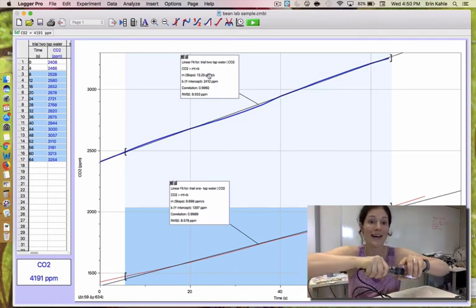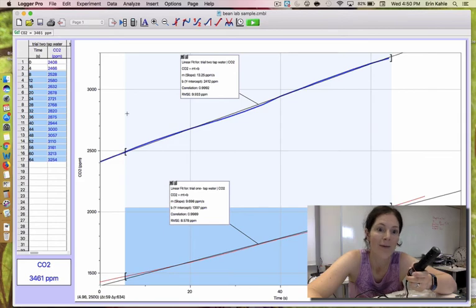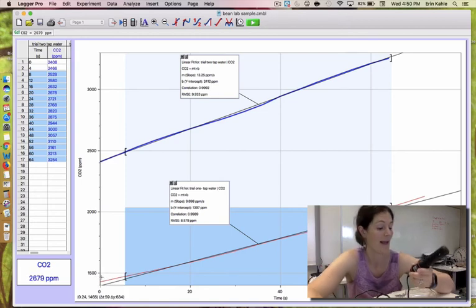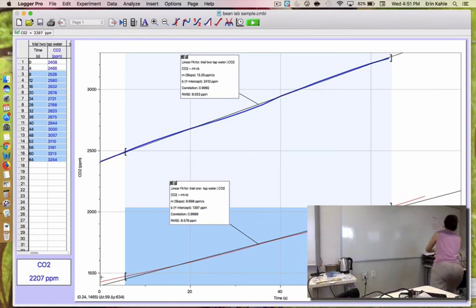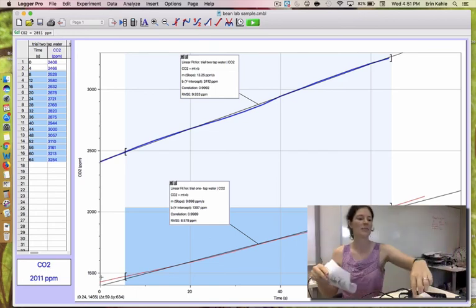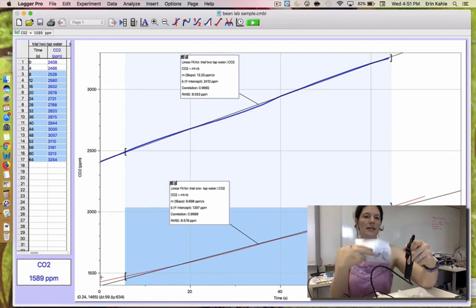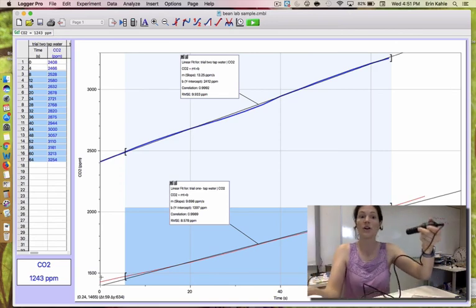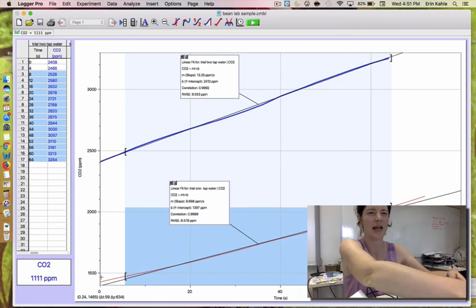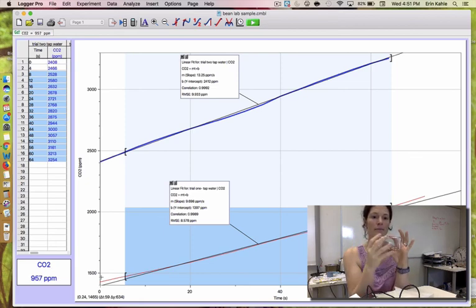And then when you're done, right now, this CO2 probe, you can see that it's measuring 4,000 parts per million. Ideally, I want to get the concentration back down to where this trial started. So it would be good if they all started at around the same place. And the way that you can do that is just take a piece of paper. It's probably not going to work great, but let me see. If you just take a piece of paper and wave it over the sensor, it should take in the normal room air, and it takes a while for this to reset. But that should go down to what we really started with in the very beginning, what was it, like 900? So this should reset.